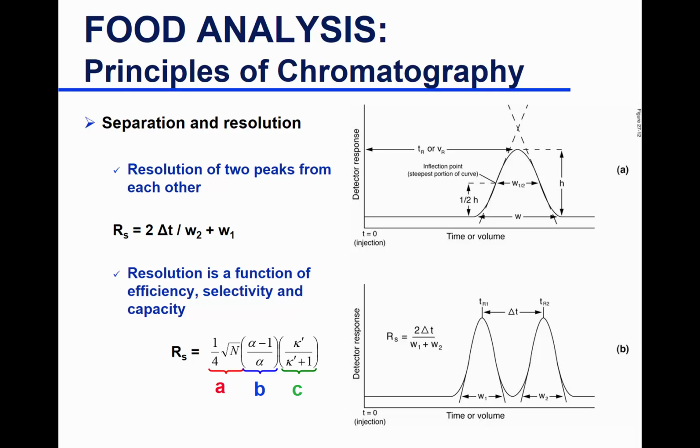if you have 2 compounds and they overlap like that, each one of them is spreading on top of each other, then you're going to get something like this. Because they're overlapping, they're diffusing together. The sharper the peak, the less the sample diffusion, then you have a really good, nice peak and very good resolution.